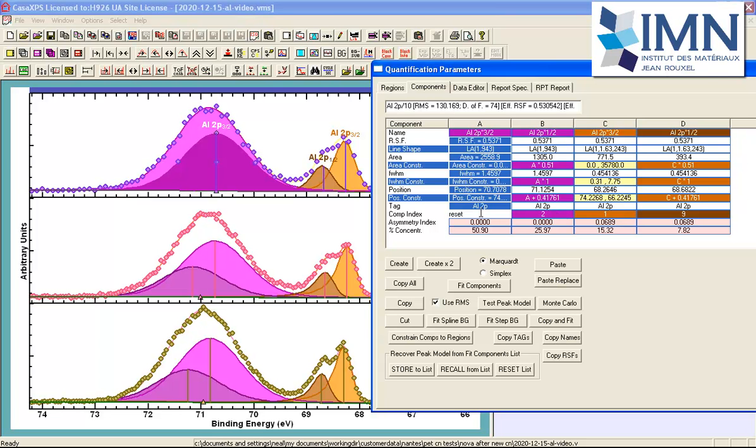And in order to return all of the component indices to their default value of -1, there's a keyword reset. So when I enter this keyword and press return, the component index is set to -1 everywhere.